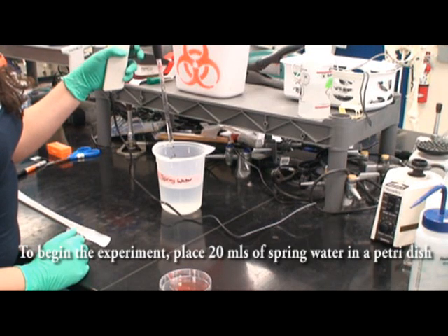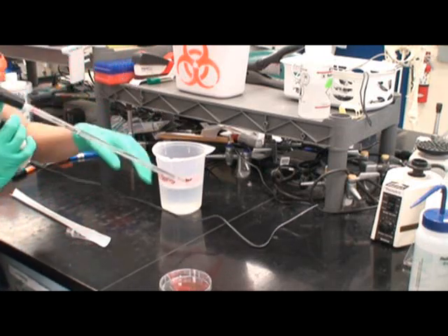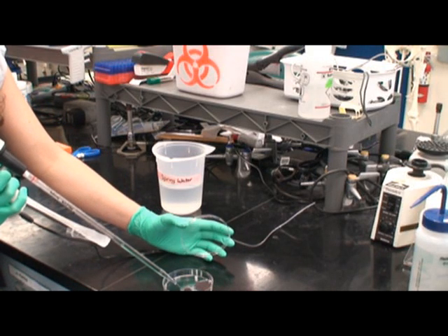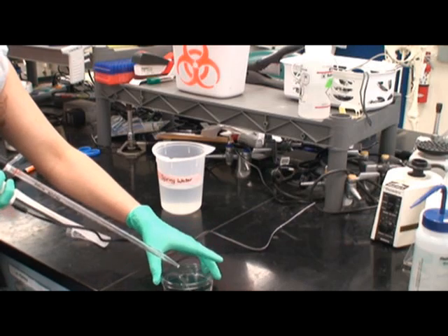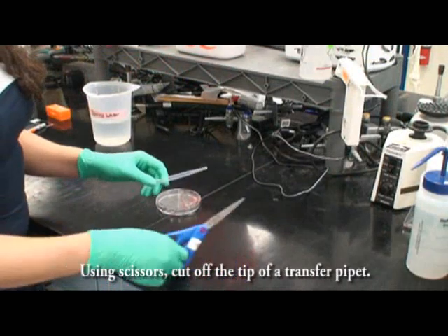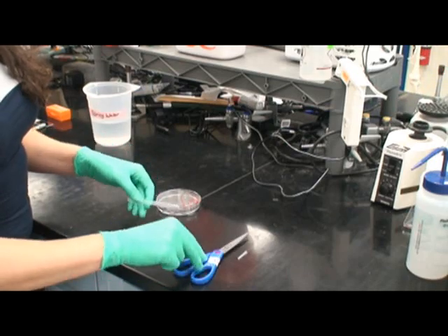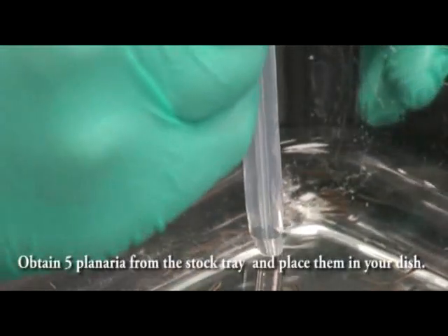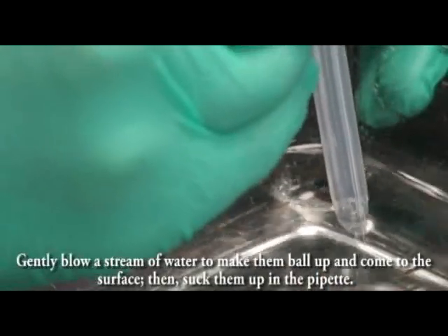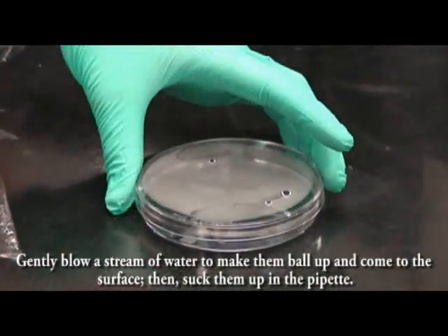To begin the experiment, place 20 ml of spring water in a petri dish. Using scissors, cut off the tip of a transfer pipette. Obtain five planaria from the stock tray and place them in your dish. Gently blow a stream of water to make them ball up and come to the surface, then suck them up with your pipette.